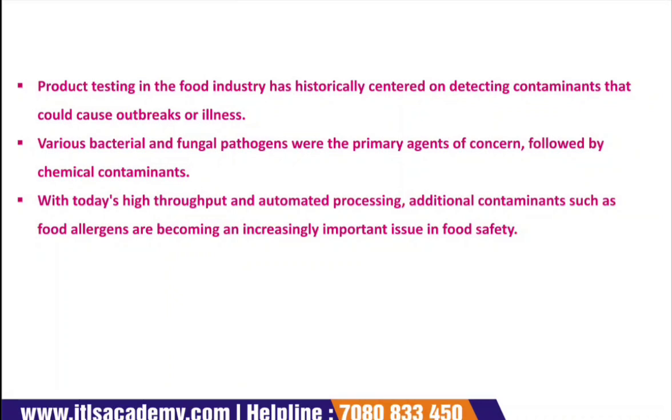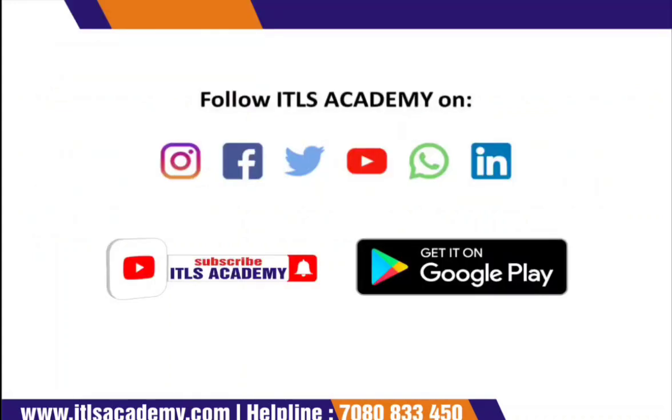To meet human demands, every industry is focusing on food safety with the help of different methods, whether it's PCR, whether it's antibody-based methods, or whether it's ELISA or many other methods. These methods are approved, and they show results that the product is free from any sort of microbial contamination. So that comes to the end of the lecture.